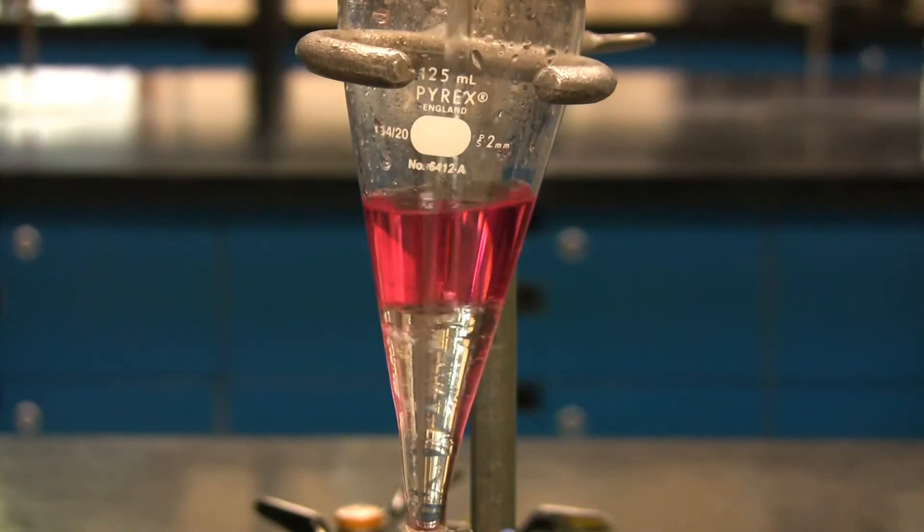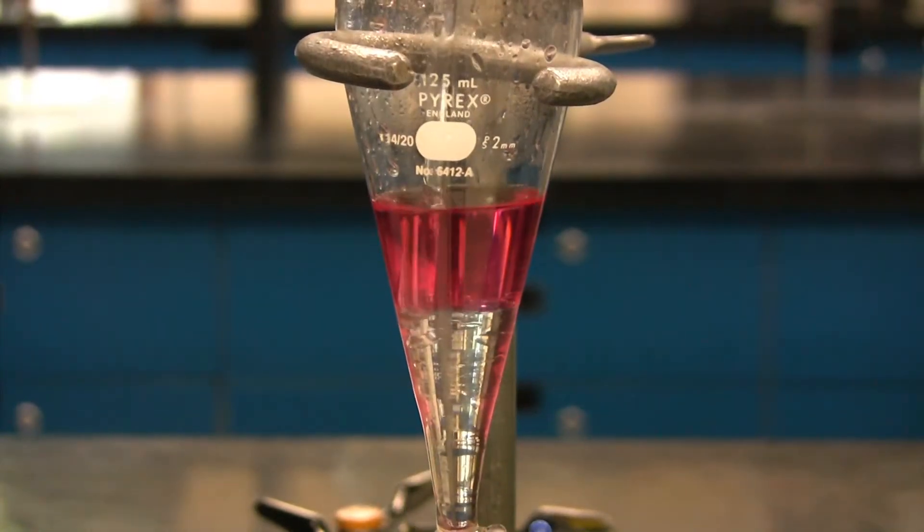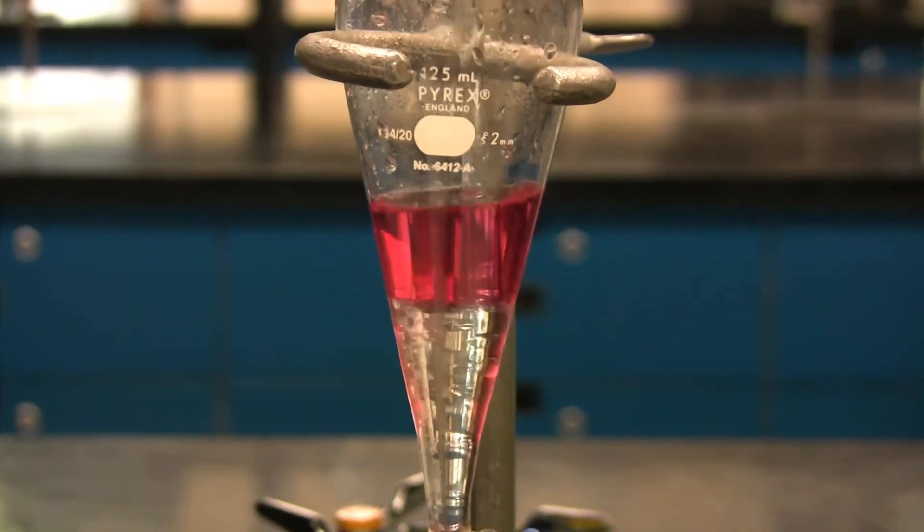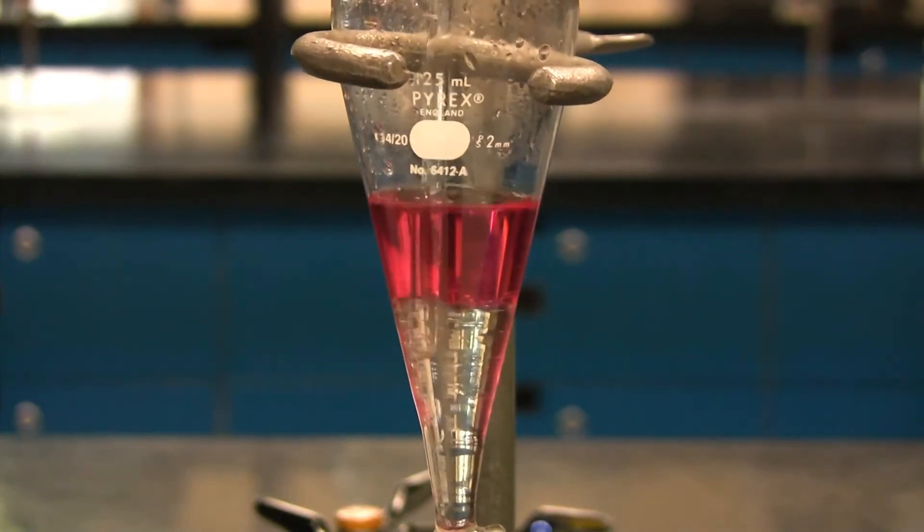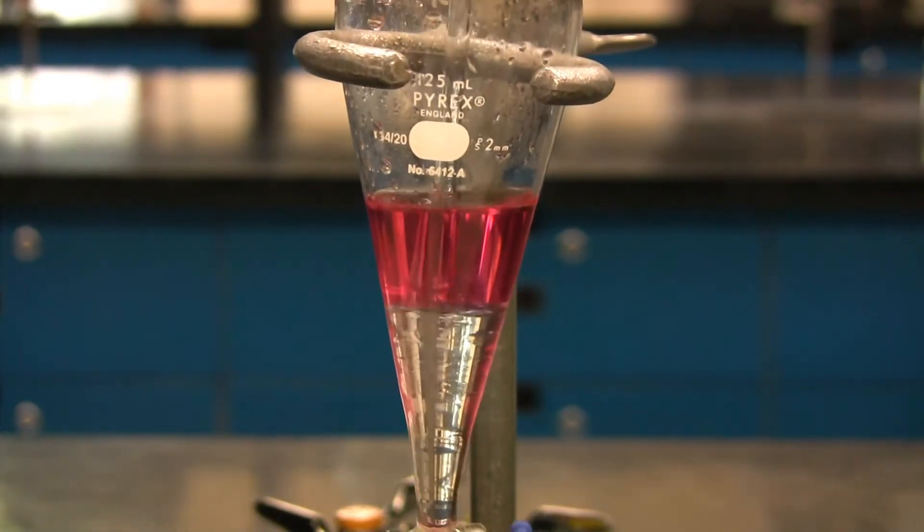Sometimes an emulsion can form between the two layers. If this occurs, take a glass stir rod and scratch the side of the glass near the two layers to break up the emulsion.